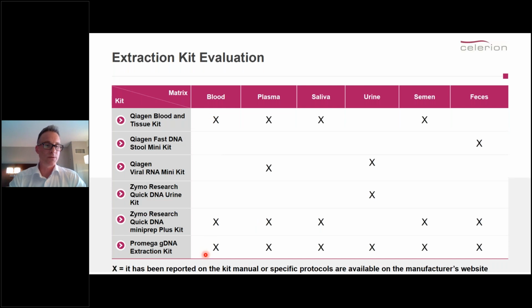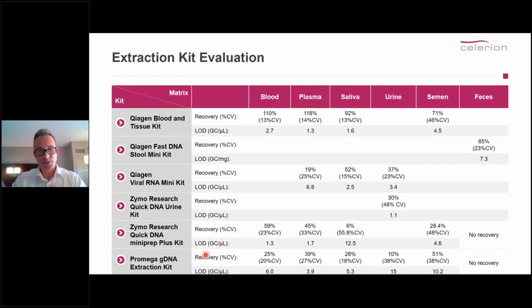We thought, well, we put them all to the test. We'll test blood against all the kits, and we did that in 3 individual separate extraction experiments, where we tested them against each other with the same spike solution, to work out which will come on top, because they all claim to be good and suitable. And the results were very surprising for us, and really showed the importance of this particular experiment, which for any future development study we would repeat, and we can't take those results for granted.